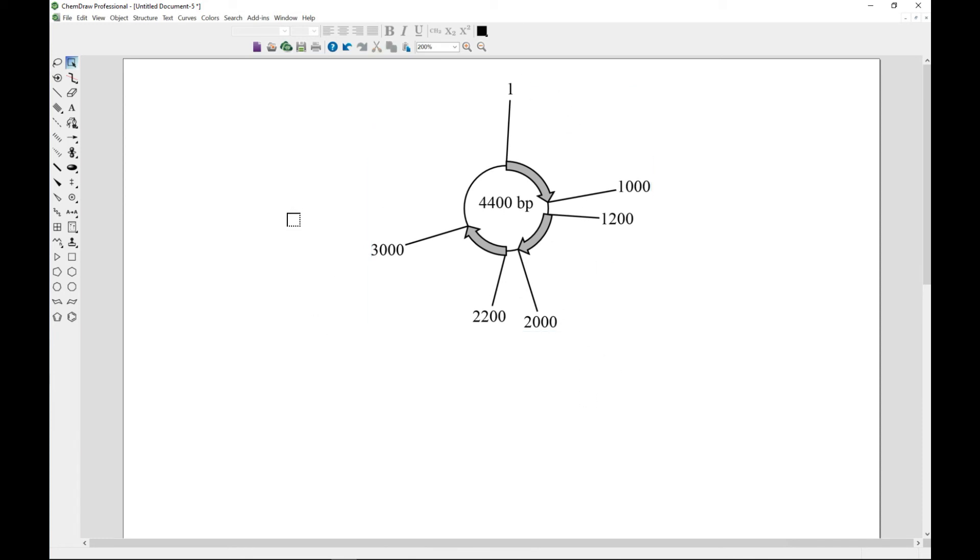You have your plasmid map over here. That is how to add regions to your plasmid map.